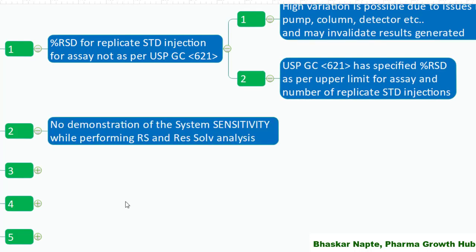No demonstration of system sensitivity while performing related substances and residual solvents analysis. These two tests quantify trace-level impurities or components, but do you have any injections confirming that your HPLC or gas chromatography system is sensitive enough to quantify those contents at the required sensitivity level? If such injections are absent, you need to include a solution that confirms system sensitivity — for example, injecting a sample solution at the detection level or quantification level and measuring the signal-to-noise ratio to justify adequate sensitivity.